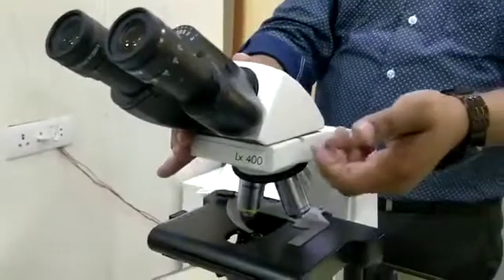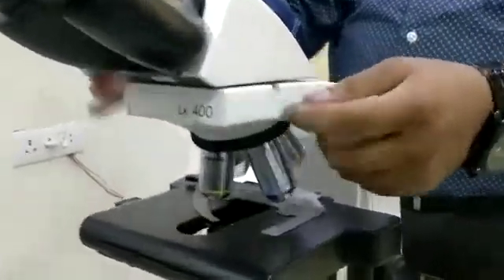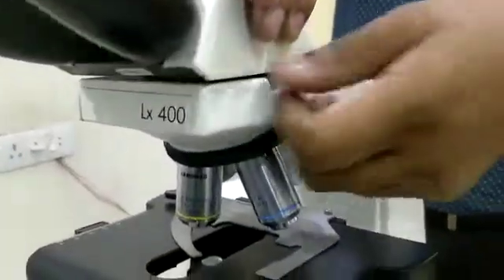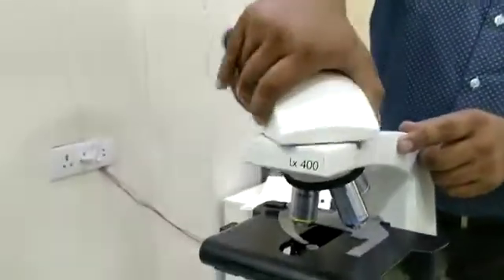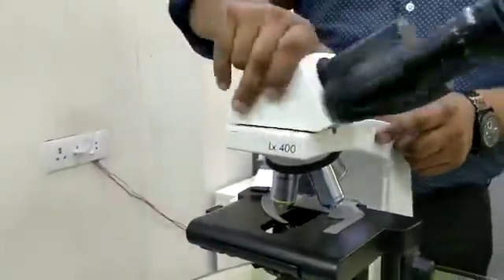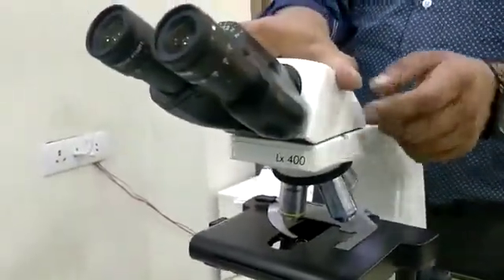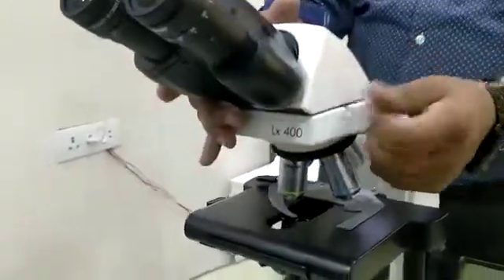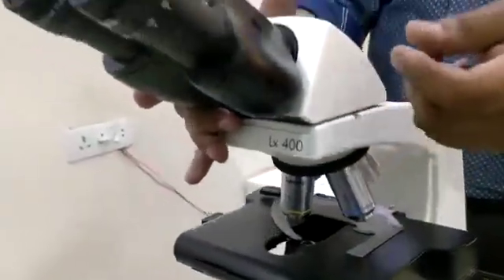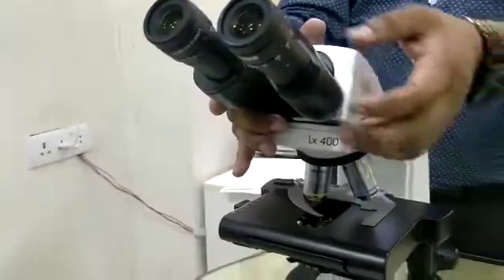Unlike other microscopes like Olympus CX21i or CX20i where you have to unscrew a screw, there is no screw here. So you can straight away rotate it 360 degrees. In other microscopes you have to unscrew first and then rotate it in an anticlockwise or clockwise direction.